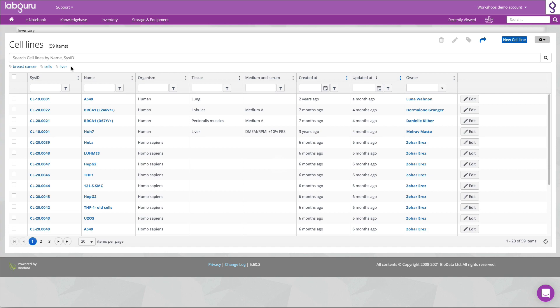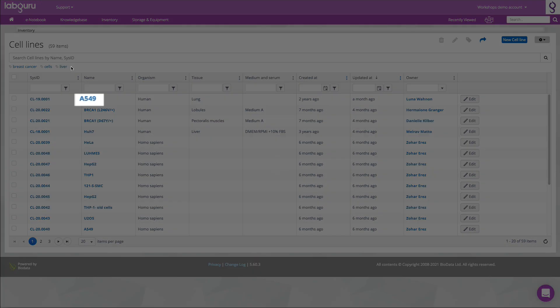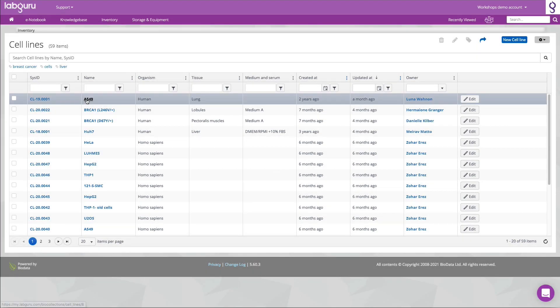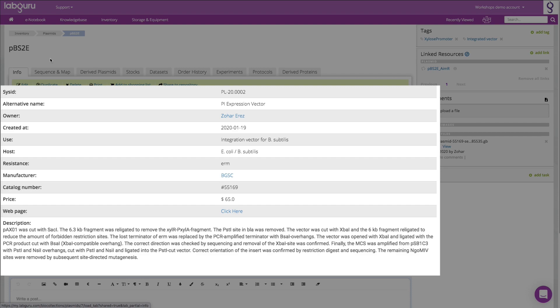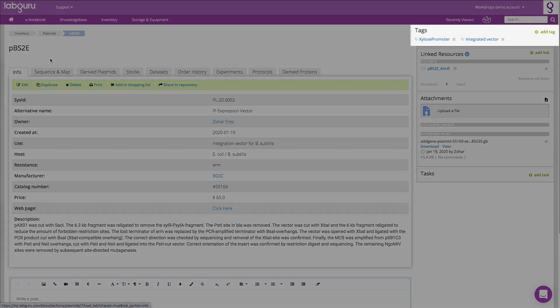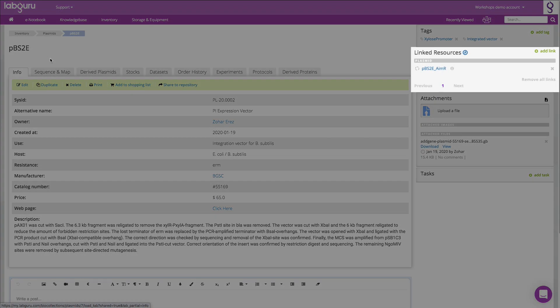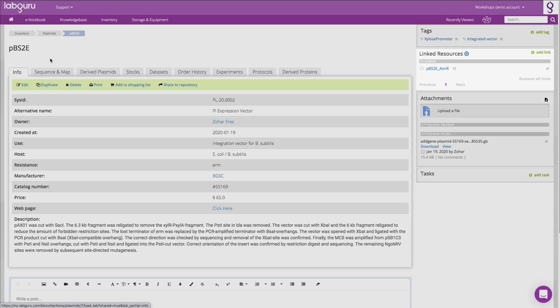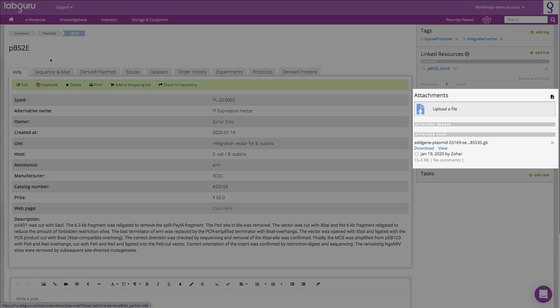When an item is documented, you can then view all the related data on an item's page, such as data fields, tags, linked resources, and attachments.